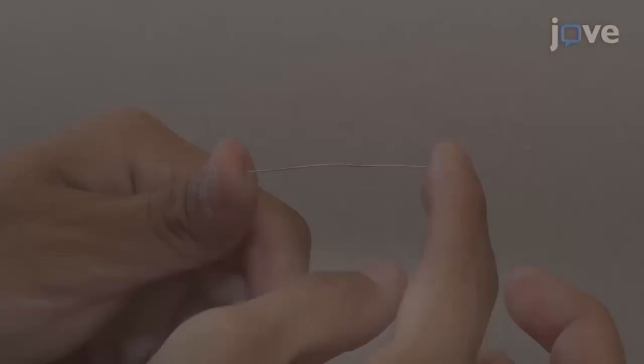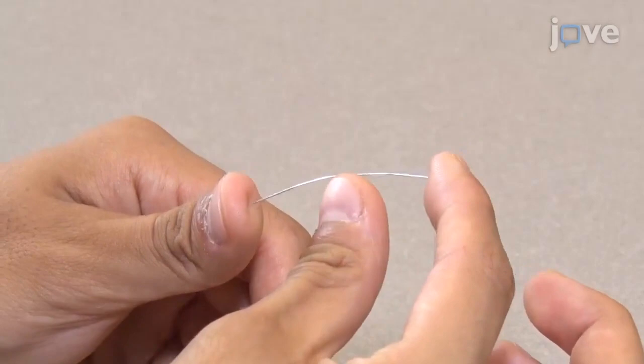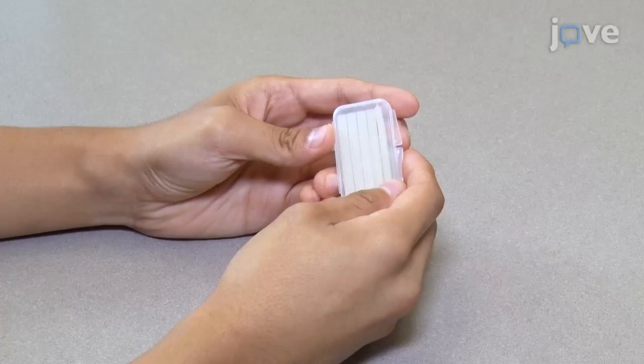To begin, bend a 40mm length 28 gauge steel wire 90 degrees at the center. Wash hands to remove any debris, dirt, or oil. Take a small amount of dental wax, slightly larger than a pinhead, and roll it between the fingertips until a ball is formed.